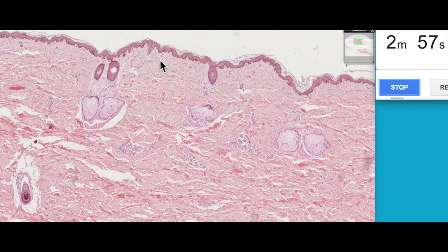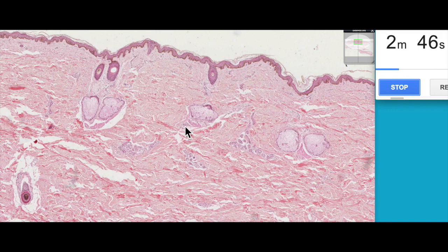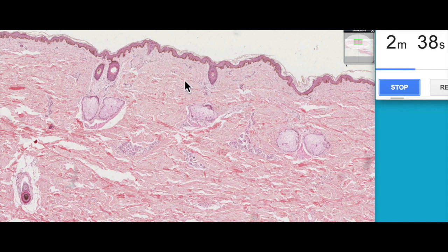If you watched our other videos, you know that the skin is divided into two layers: the epidermis, which is the stratified squamous keratinized epithelium on the surface, and then the dermis, which can be subdivided into two layers — the papillary dermis, a layer of loose connective tissue immediately beneath the epidermis, and then the predominant part of the skin, which is the reticular dermis, made up of dense irregular connective tissue.